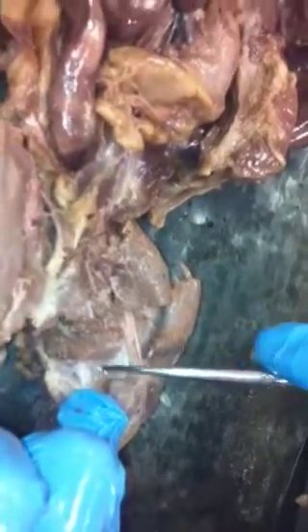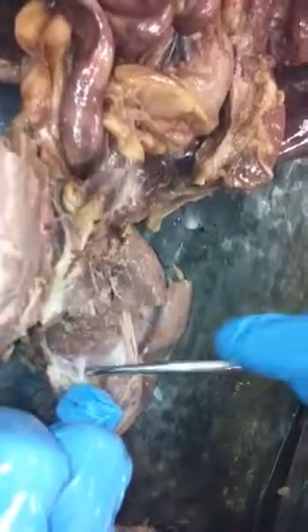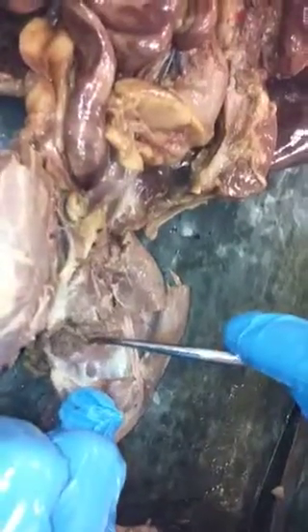All right, now give me the muscle names. Sartorius, with the flaps. Sartorius, rectus femoris. When you cut, this is sartorius, rectus femoris. Okay. Then we get our adductor longus somewhere right here. Somewhere in this region you have your adductor longus and adductor femoris. Adductor femoris is going to be to the bottom. Adductor longus is going to be to the top right here.